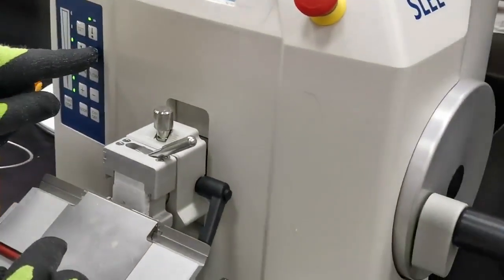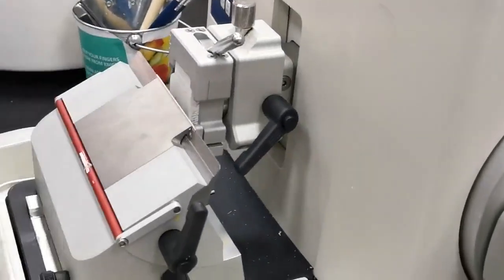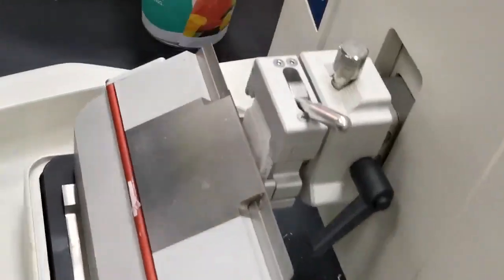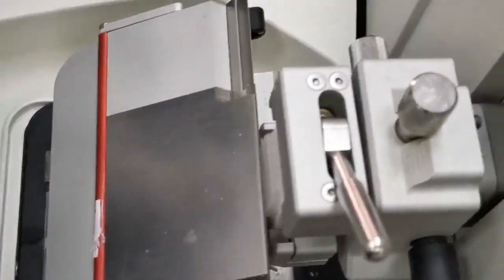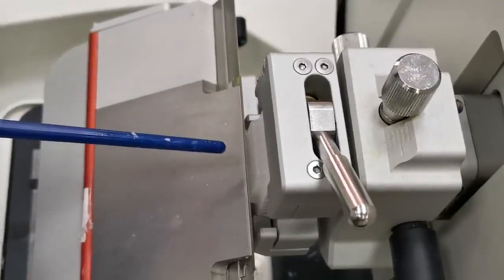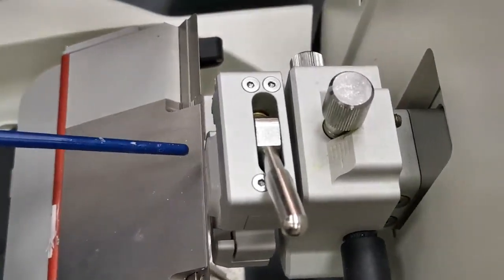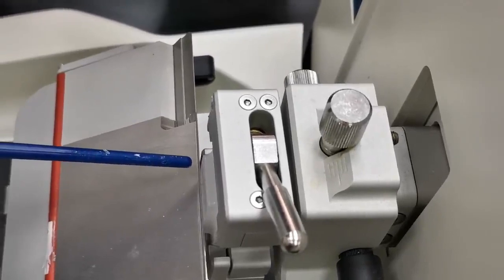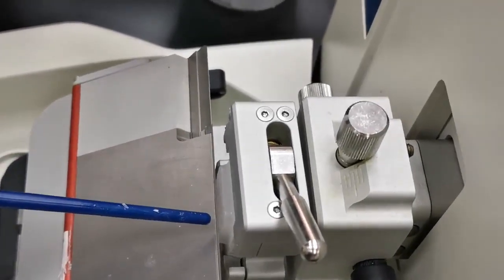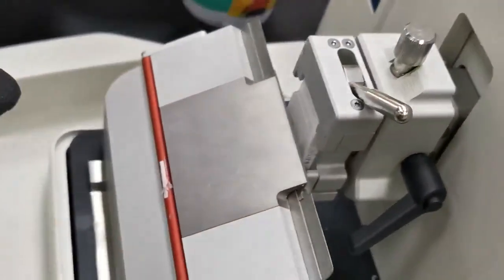Remember to tighten everything, then use the electronic controllers to move the block as near as possible to the knife. Looking from above, you can see how the block is aligned with the knife. If they are parallel, no alignment is needed. If one area has a shorter distance to the knife edge and another a longer distance, you need to do alignment.